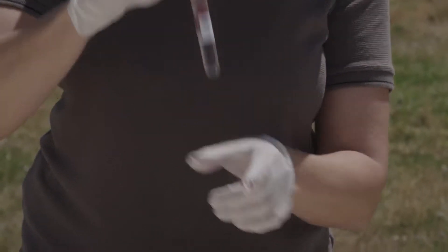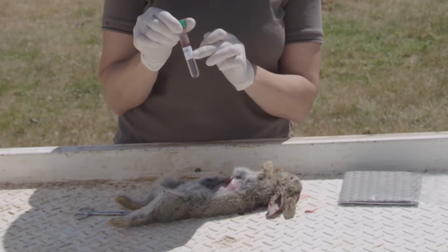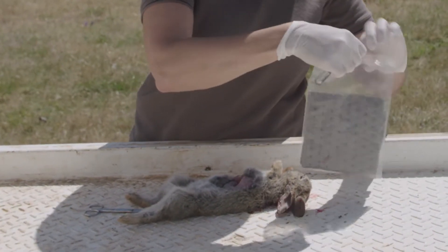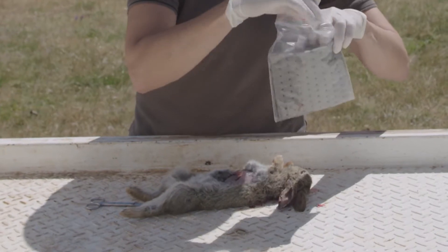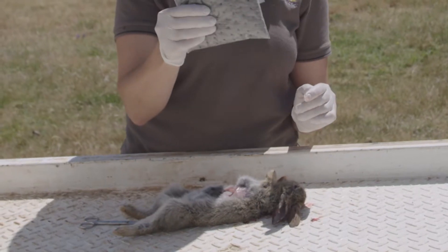Make sure that if you've got multiple rabbits, the rabbit that you're sampling matches the label that we've provided for you on the tube. Then place it back into the case and into the reply-paid envelope, and pop it in the post.